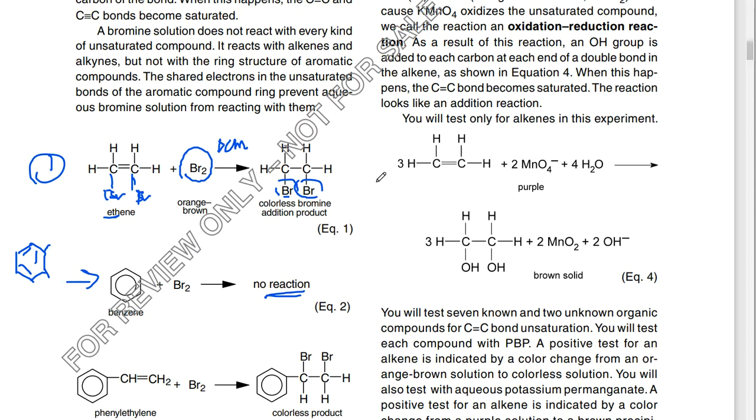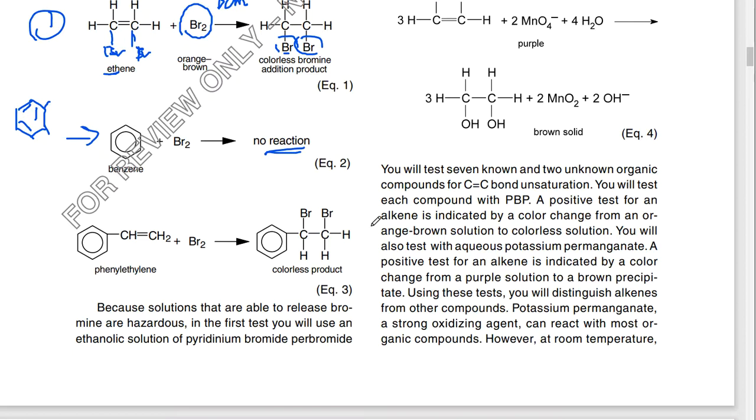All right. Now, however, if you look at this next example, we do have an aromatic. We see that benzene that's right there. But the double bond that is targeted is not part of the aromatic. So it's okay with this one, and that's because it's not disrupting the ring. It's disrupting another double bond somewhere else that's not a part of the ring. So this does give us a reaction that we can go forward with.